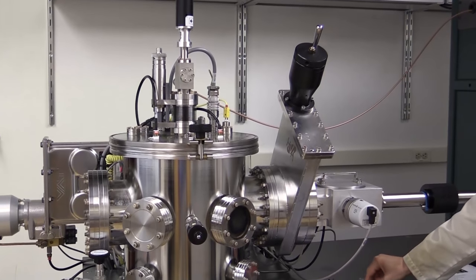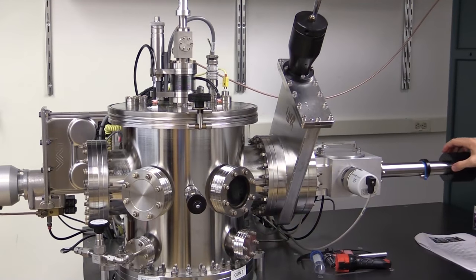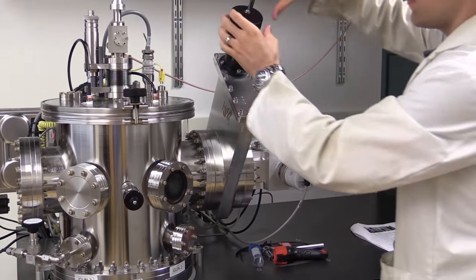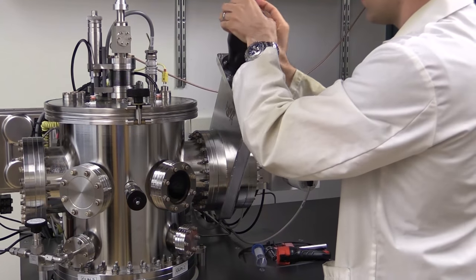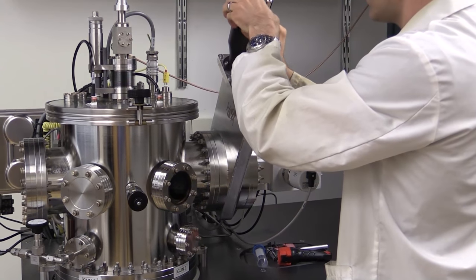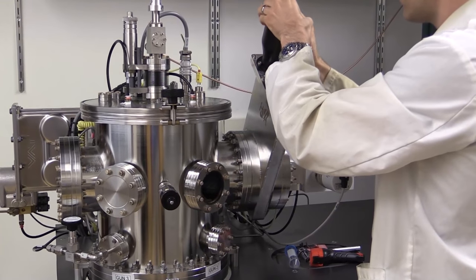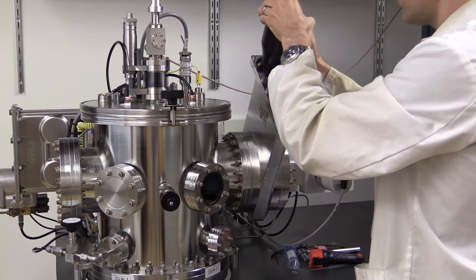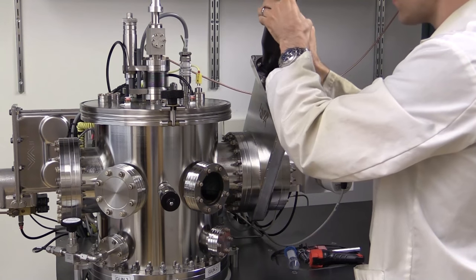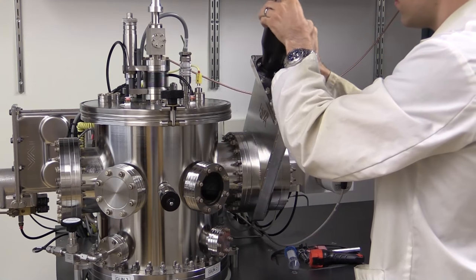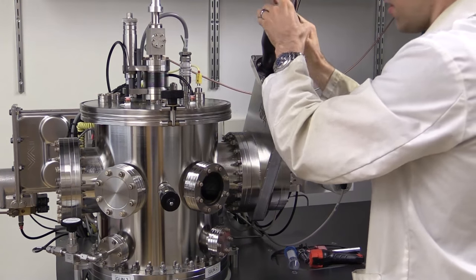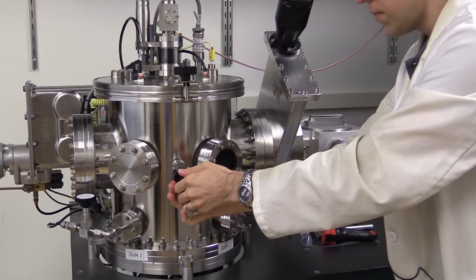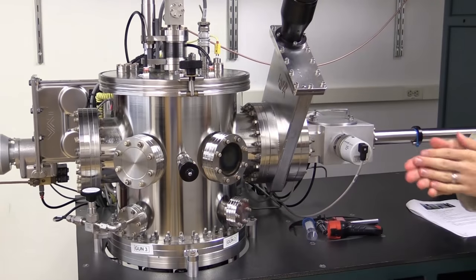I'll move the tray back from the main chamber to the load lock. Now I'm going to close the gate valve by rotating this clockwise. I'll close the viewport shutter. And now we're ready to do our sputtering process.